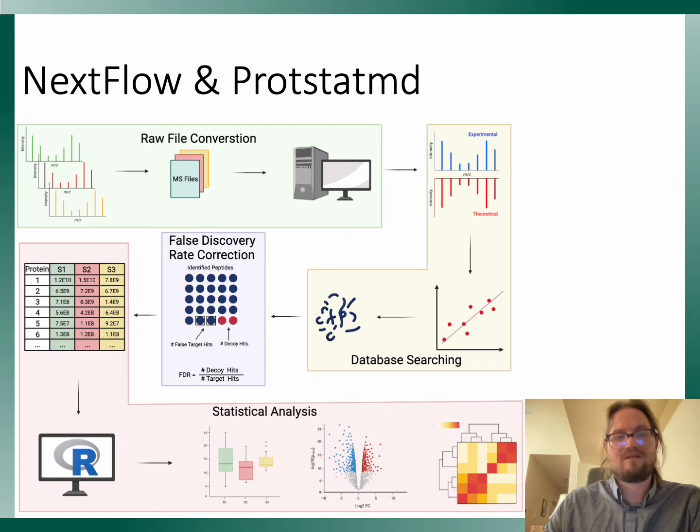In the default Nextflow environment, the statistical analysis is using MSstats for area under the curve analysis. In ProtStatMD, we use edgeR to compute the statistical analysis using peptide spectral counts. All of this is done in one line of code.